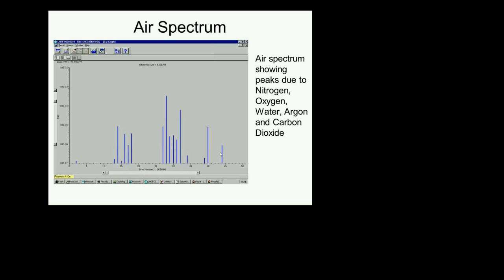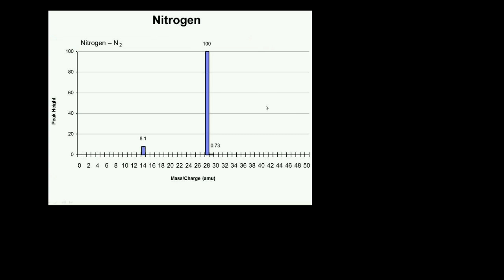Done. It's solved. So at that point, you use the same RGA now. You don't turn it off. You bring some helium, and you leak check the system, and you start looking at mass 4, and you debug your leak right there in front of the vacuum system. You can do that with an RGA, and this is the only reason why I say you should never build a vacuum system without an RGA in it.